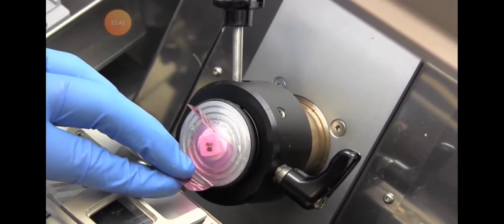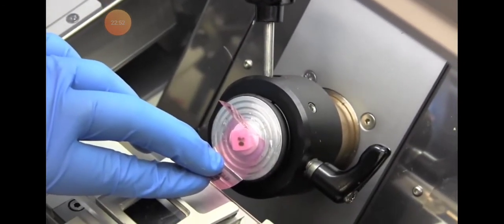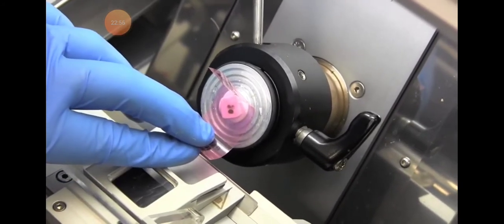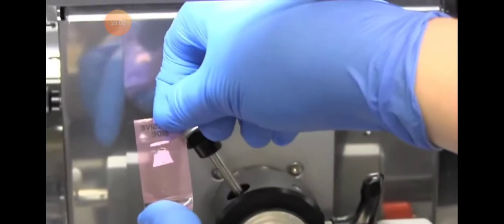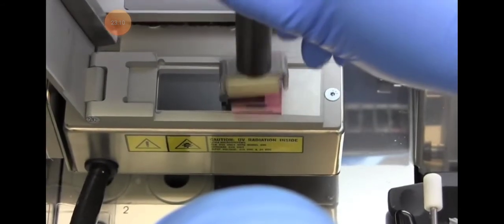Advance the wheel forward on the fine setting, so make sure you're not still trimming. And what you're going to do is cut an 18 micron slice and pull the tape towards you gently and quickly so that you don't have any tape sticking to the blade, like this. As you pull it off, you should be able to get a nice section that you can put on to the slide, and then roll that section on.